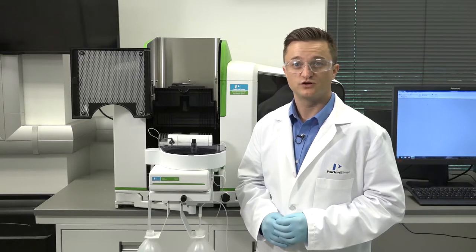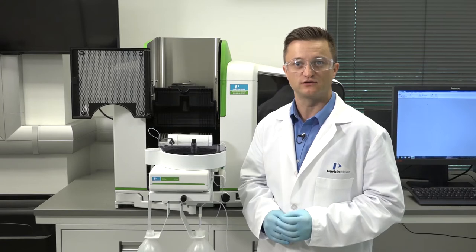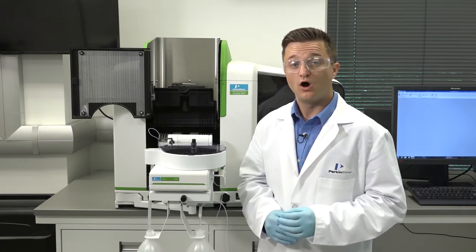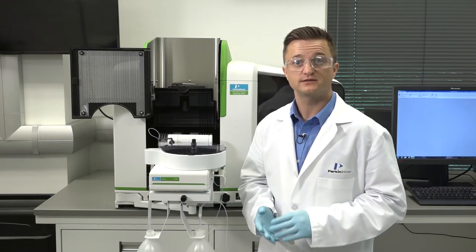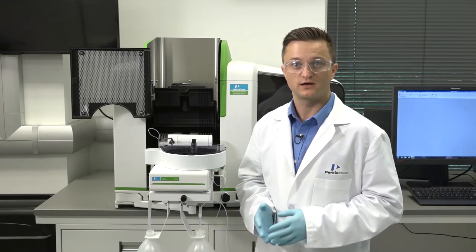The graphite tube is the heart of the graphite furnace and it plays a vital role in the overall stability of an analysis. In order to ensure stable analytical conditions from one atomization cycle to the next and from graphite tube to graphite tube, all graphite parts, contacts, tubes and platforms are subject to strict quality control.